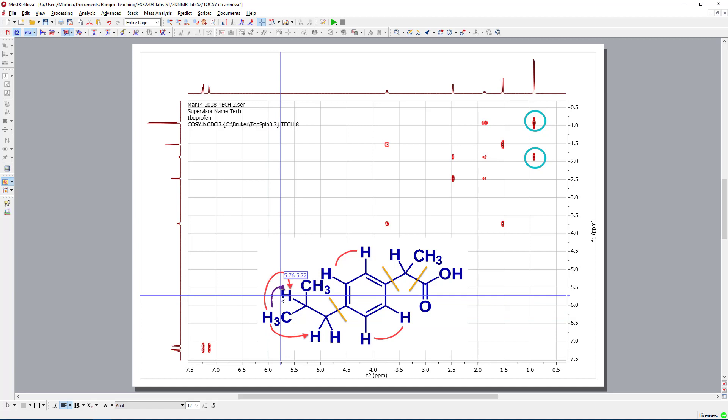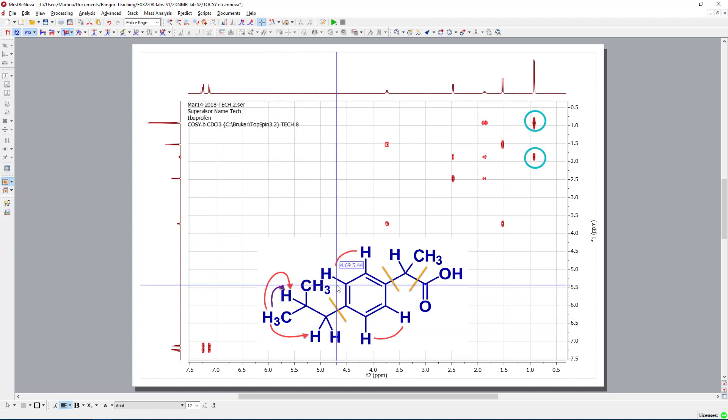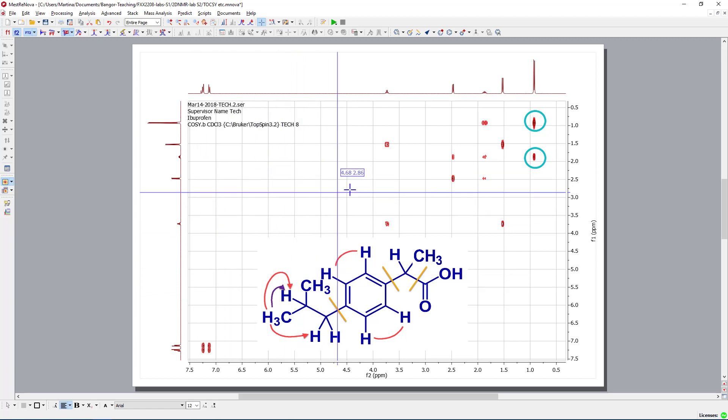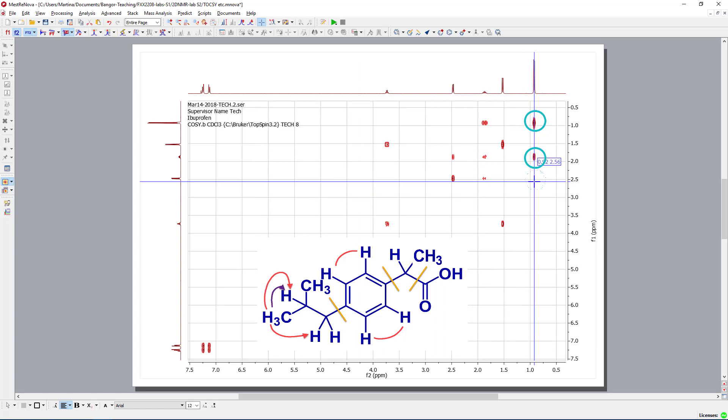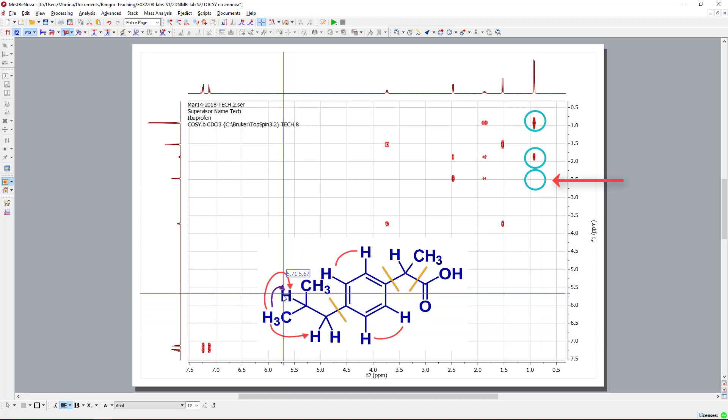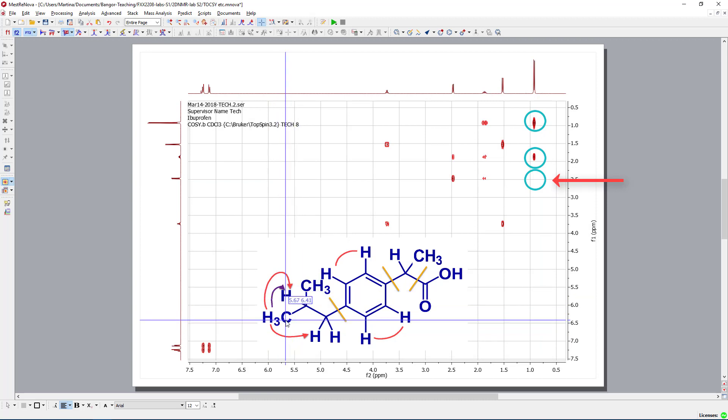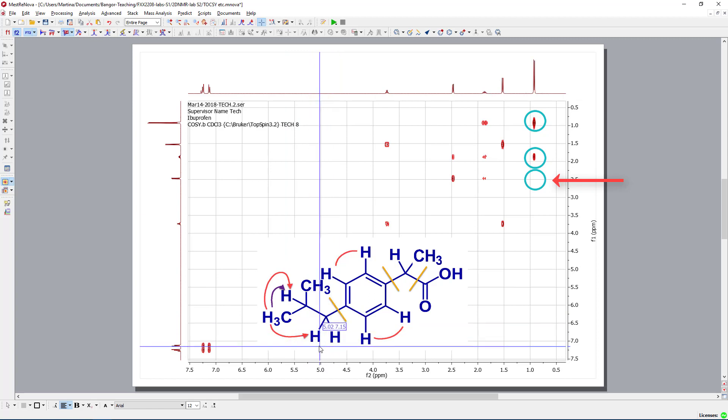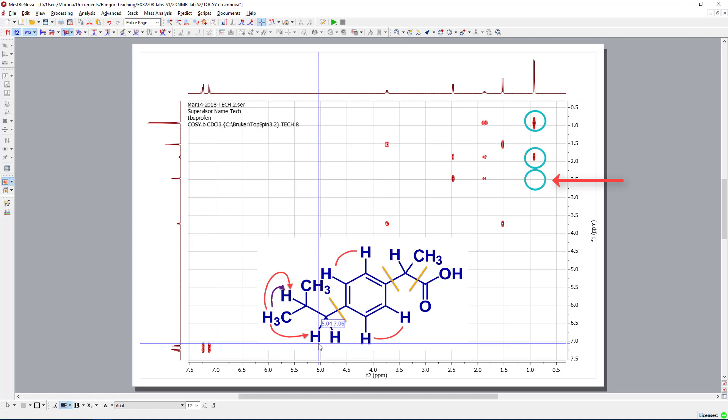However, if we would have run a TOCSY, we would have seen an additional peak. We would have seen a spot on this position. That one we won't see here. Because this methyl group can only couple with this hydrogen atom. It can't couple in the COSY with this CH2 group, because it's too far away. However, in a total correlation spectrum, this would be possible.